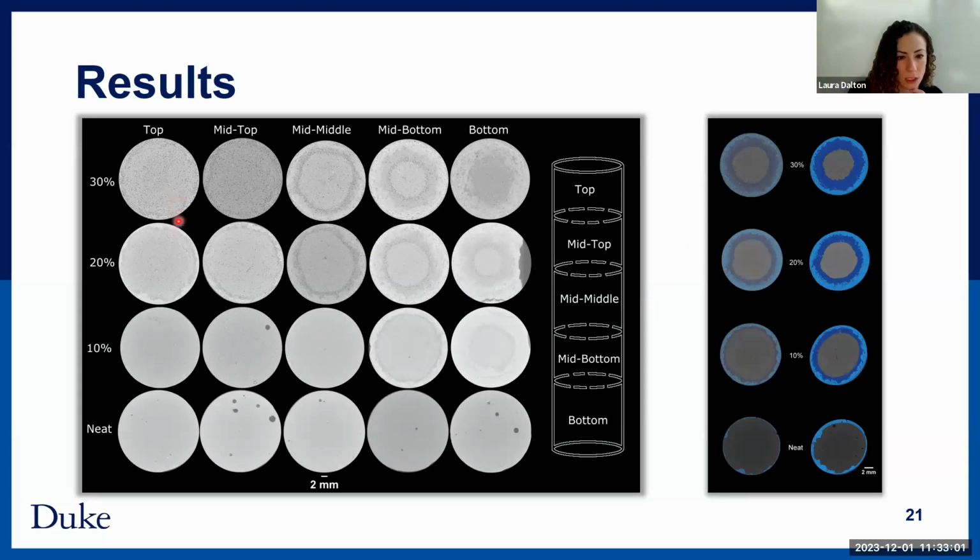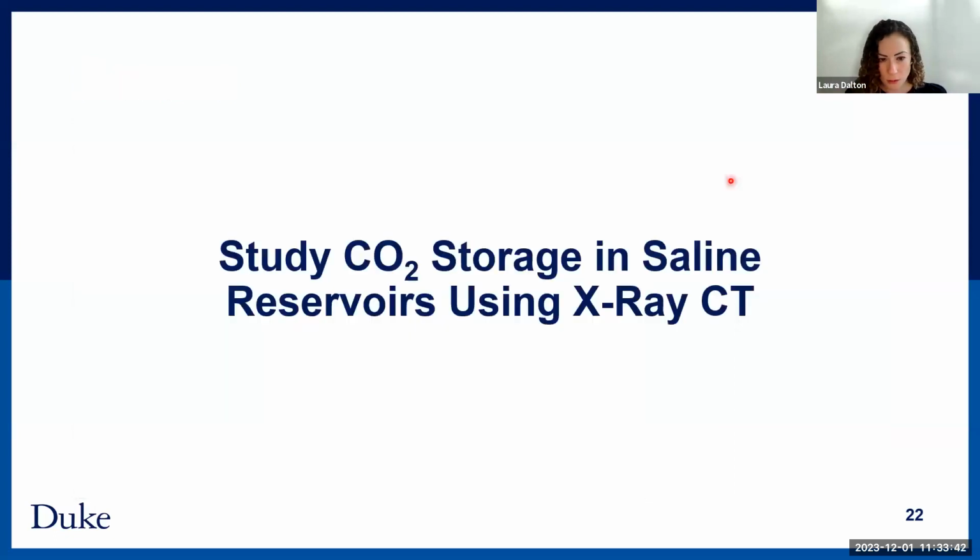And so what we were able to do here, this is just a regular cement paste. This is a 10% quality foam cement, and then a 20%, 30%. What we can clearly see is that as it was submerged in this CO2 saturated salt solution, it was penetrating into the sample radially, from outwards inwards. And so we could quantify just how far that happened and start to characterize how quickly this material could degrade under these conditions. So that was something I worked on for a little bit.